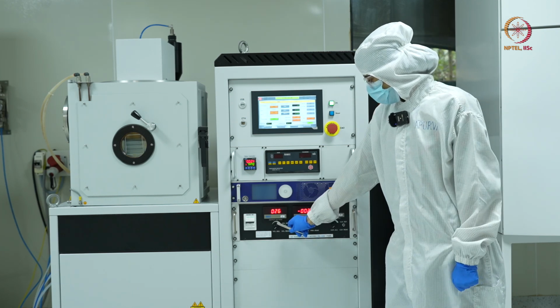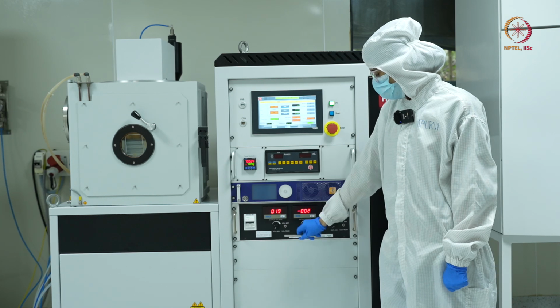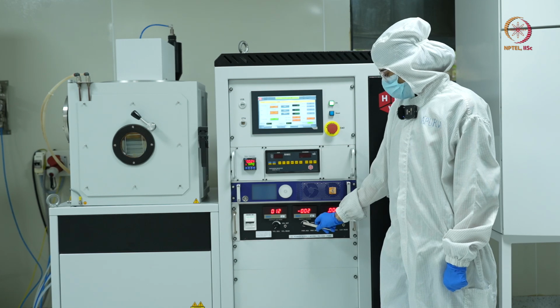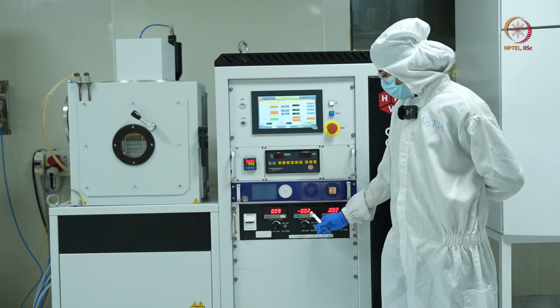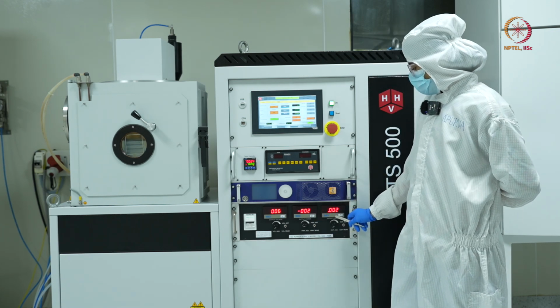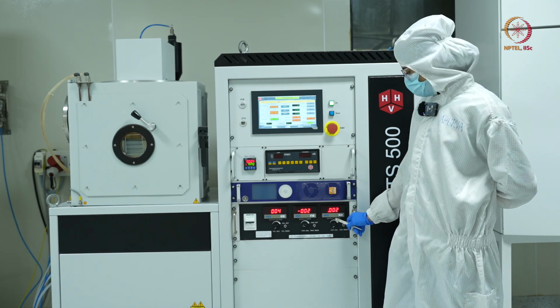This is the knob for voltage, and I'll increase my voltage to 600 volts. This is my current knob. This is my power knob, and here I have already set my power to 300 watts. When I want to start the deposition, I will start increasing the current.